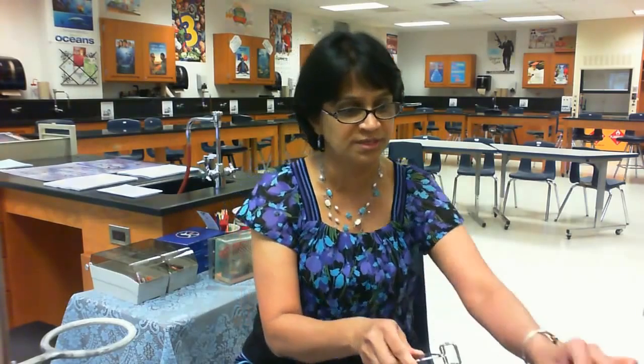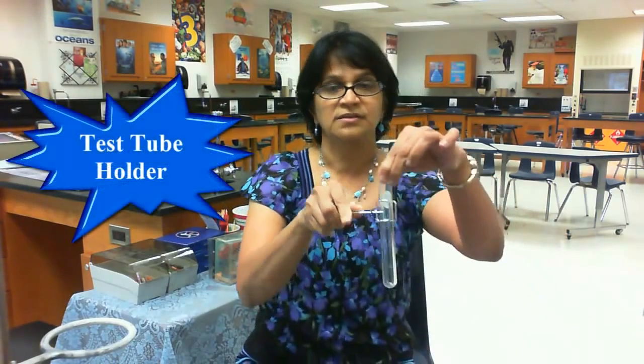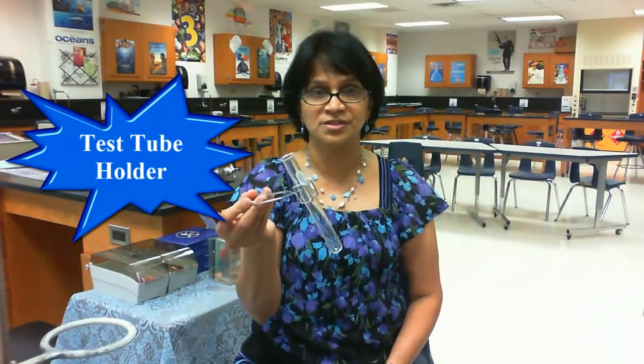Alright, if the test tube is hot, we are going to use something which we call the test tube holder, and let me show you. That's the way you're going to use a test tube holder.